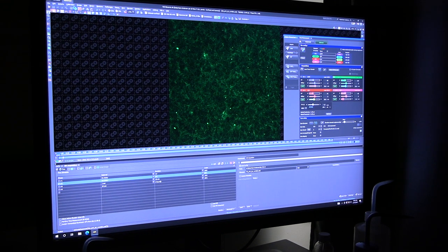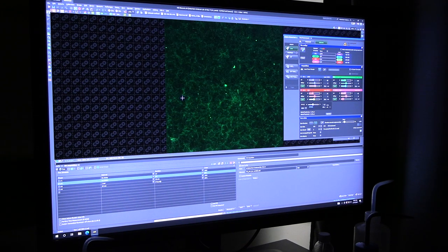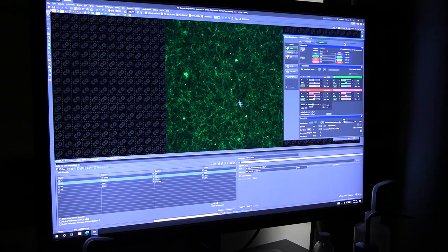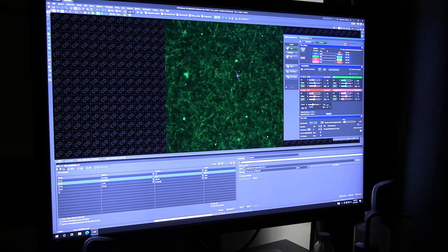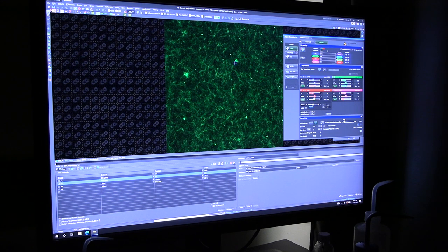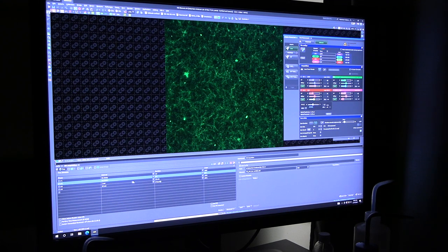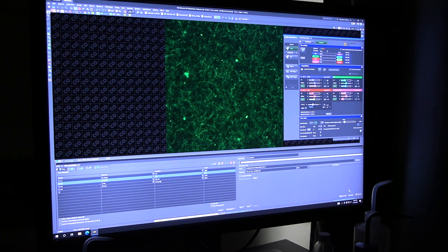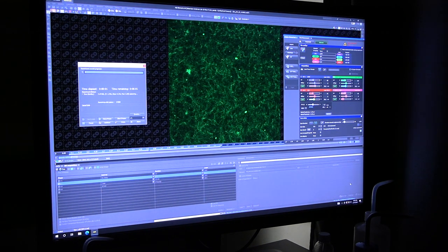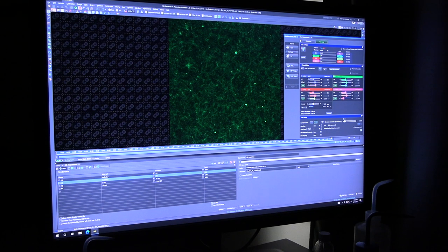I'm imaging my sample on the confocal now. You'll see that when we're in the sample, our microtubules are labeled in green, and you should see something like this, a nice homogenous network. Lots of nice filaments here. You'll always see clumps like this, it's okay. If you see larger scale clumps, it may be indicative of a problem like a reagent going bad. I'll take a quick time series so we can see a gist of what kinesin activity should look like. Let's give it a second to acquire and let it run for a few minutes.